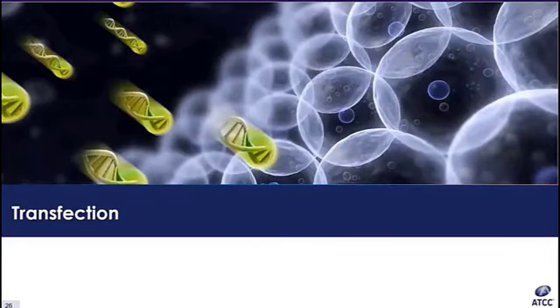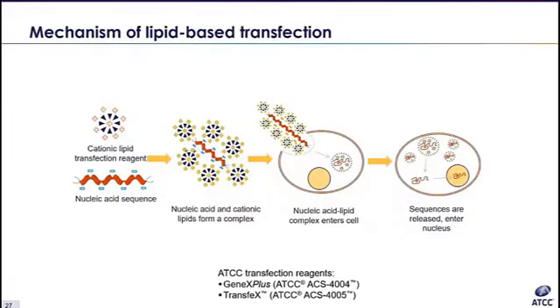Okay, we're going to switch gears again and talk a little bit about transfections and what transfection reagents you can use. So now I'm going to discuss the basic method of lipid-based transfection. Since transfection is a method for introducing exogenous nucleic acid sequences into cells, there are various ways to accomplish this. One of the most common is lipid-mediated transfection. Lipid-mediated transfection is the most accessible and usually the simplest method available.